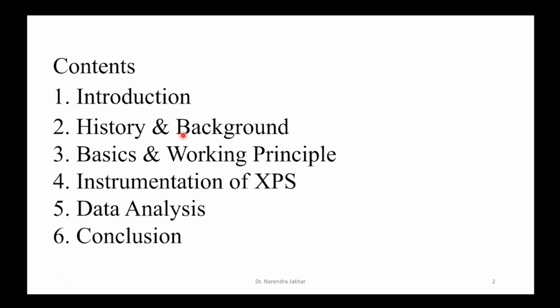From my point of view, it is always necessary to have a peep into the history to get a better idea of scientific developments. Since we are going to introduce XPS, a very fine characterization technique, it is essential that we know the different scientific contributions across the globe that brought XPS to this level, followed by the basics and working principle of XPS.